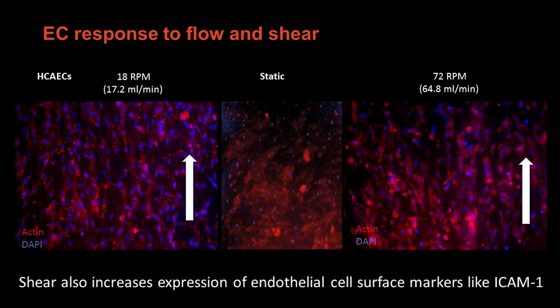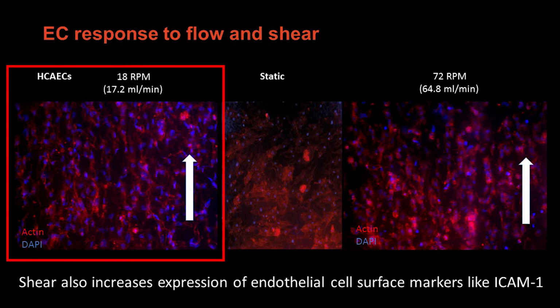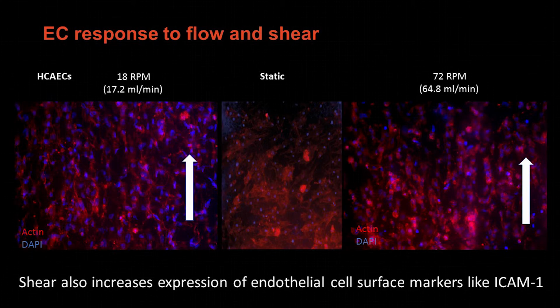So maybe we'd seed endothelial cells, we'd watch them adhere, and then we'd watch them grow over time. The final thing to say about the model is that this flow and pressure that we're applying to it really significantly changes the cell behavior. You can see in these ones where there's either no flow in this middle part where it's static, or mid flow or high flow, you get alignment of the endothelial cells that is more replicative of what you find in real tissue. And then the endothelial cells start expressing cell surface markers that they would normally express in tissue, like ICAM1. This gives us the sense that under these flows and under these pressures, they are more like we would find in real vasculature.